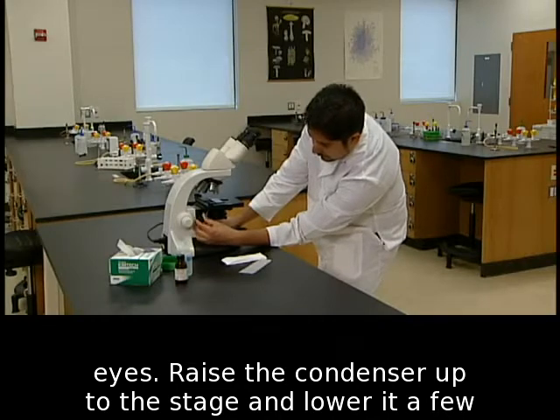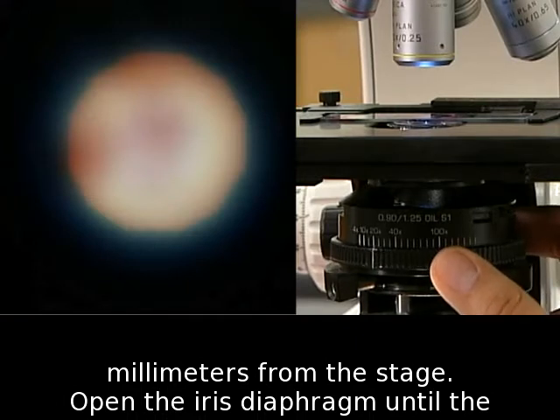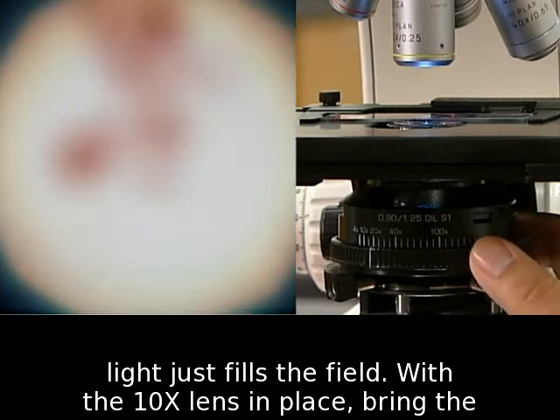Raise the condenser up to the stage and lower it a few millimeters from the stage. Open the iris diaphragm until the light just fills the field.